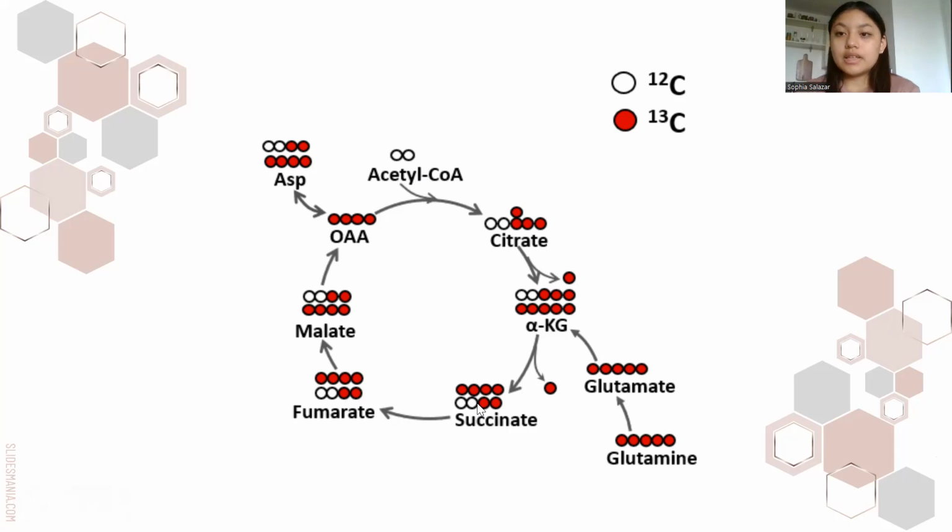In this study, I use carbon-13 to measure the flow of carbon. Carbon-13 glutamine metabolism will also have carbon-13 in the metabolites, and this can be detected even in a metabolite that has an endogenous carbon-12. The flow of carbon is determined by comparing the metabolic production behavior of the reductive or oxidative TCA cycle.